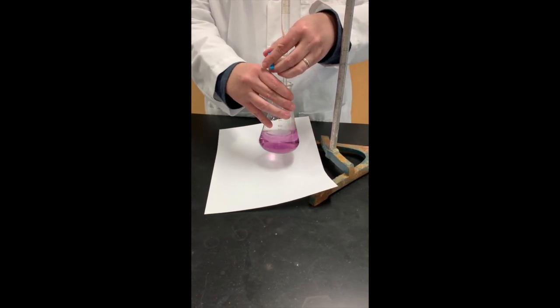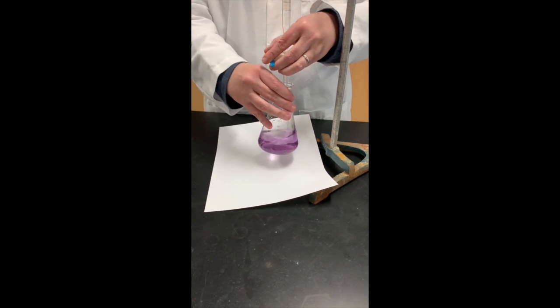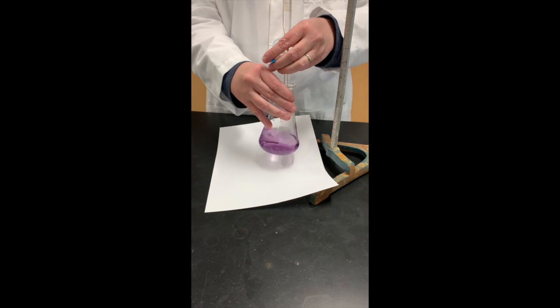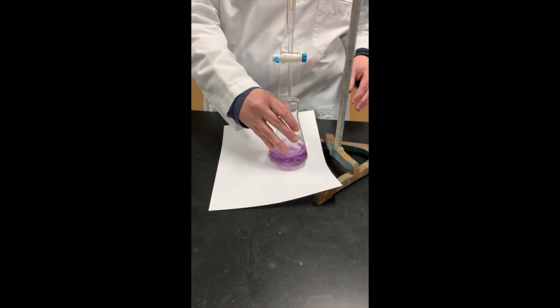Starting to see a little bit of a color change, so I slow down. And that's probably purple, so let's add just a little bit more. And so this is the hard part of these titrations, because I don't know if that's actually purple or blue, so I'll add just a little bit.